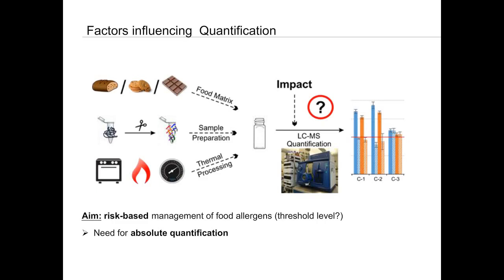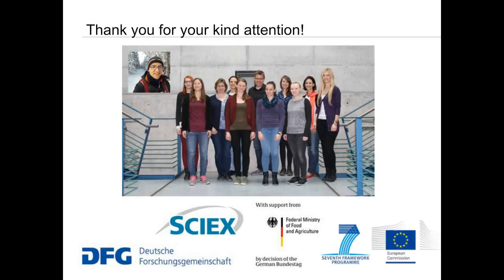Basically, when it comes to food authentication and not food allergen detection, PCR, of course, also has its place and has worked in the horse meat scandal, but there are specific problems with highly processed samples. So the processed animal proteins, which I've presented in my presentation, we obtained these samples from a research group that worked on PCR detection and really told us we do not see anything using DNA-based techniques. Are you able to see anything in these samples?